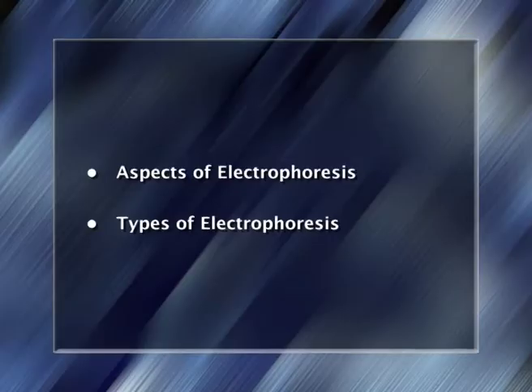Hello friends and welcome. Today we shall talk about electrophoresis. In today's deliberation, we shall discuss different aspects of electrophoresis and its various types.